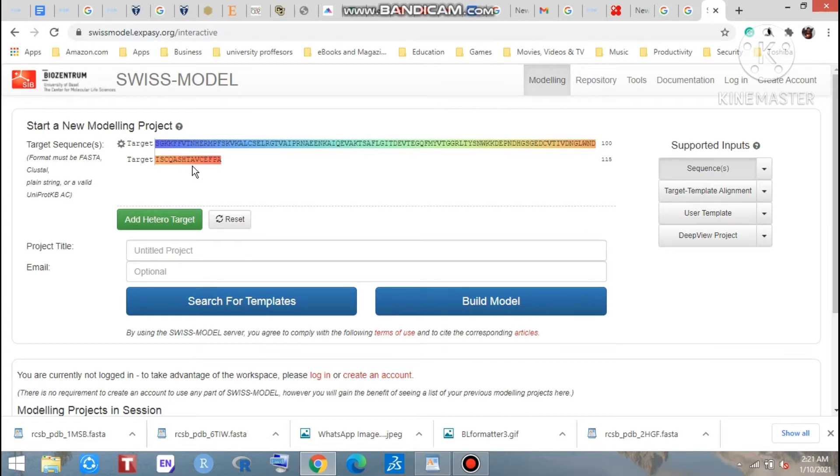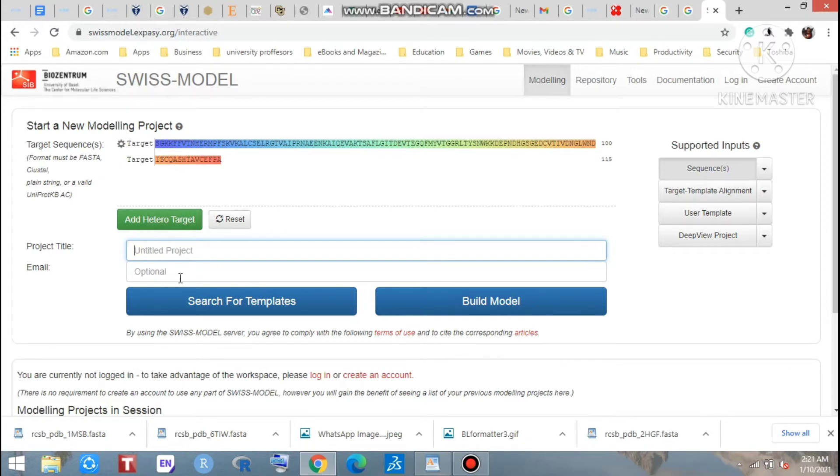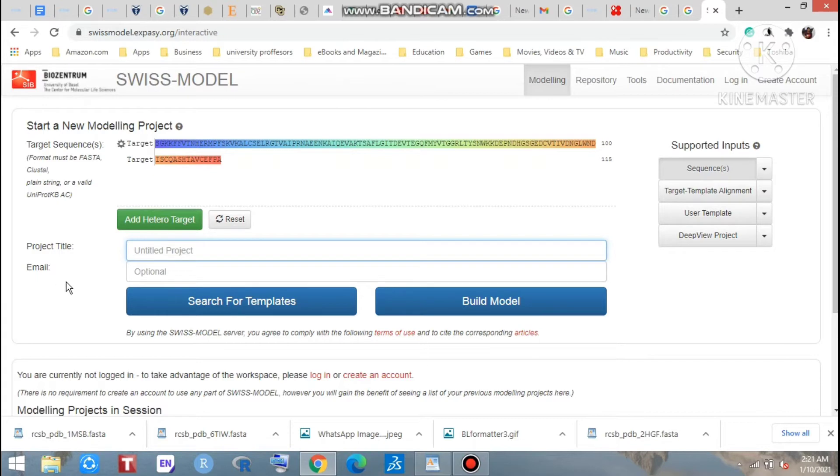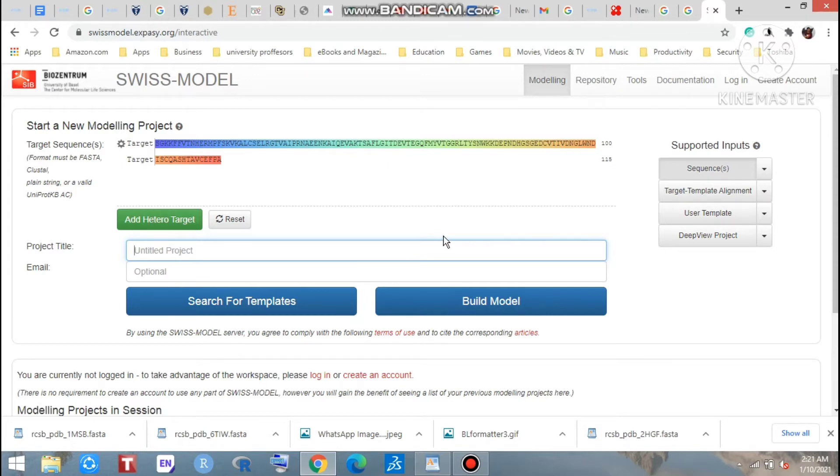And if you want, you can click here and you can put the name of your project, and if you want you may write here your email - you will get the result in the email, but that's optional.